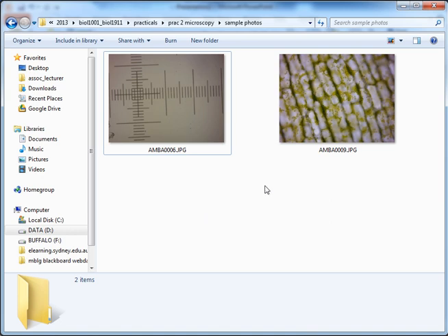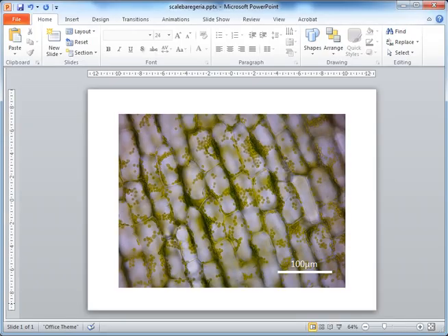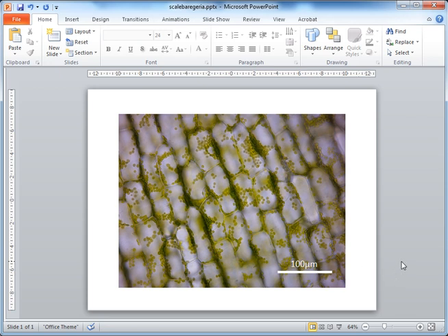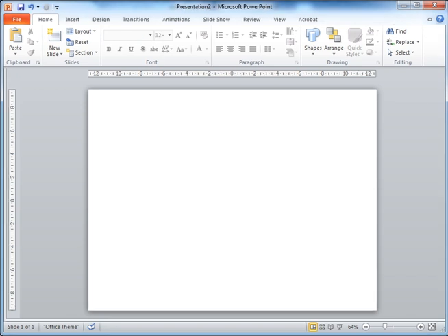Using that information, we can draw an accurate scale bar onto our original image. What we end up with at the end of this tutorial is something that looks like this — the Egeria image with a properly labelled and proper-length scale bar. We'll use PowerPoint because it's nice and easy — it can manipulate images, draw lines, and put in text boxes pretty efficiently.